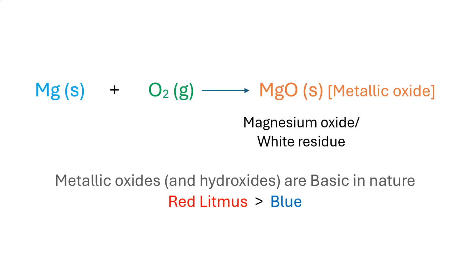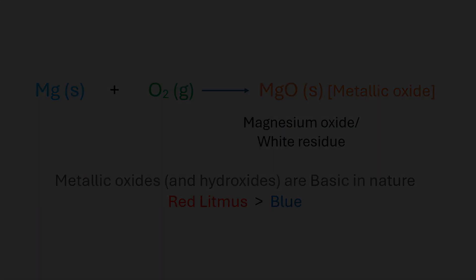The reaction of magnesium with oxygen can be summarized in a simple chemical equation. The white residue formed at the end of the reaction is magnesium oxide. Metallic oxides and metallic hydroxides are generally basic in nature, which is why the red litmus turned blue when in contact with the residue. Had it been acidic, the blue litmus would have turned red, which was not the case. The reaction of magnesium with oxygen is also classified as a combination reaction because a single product is formed by the chemical combination of two reactants.